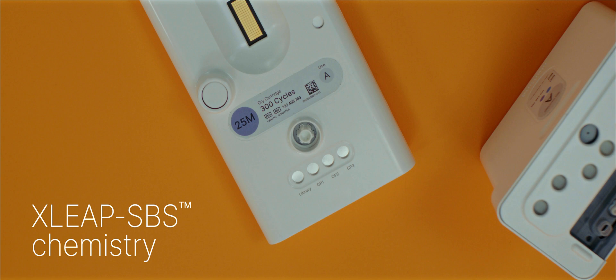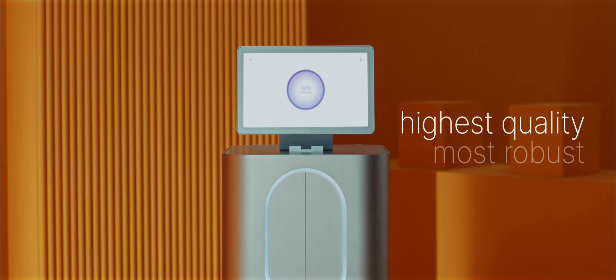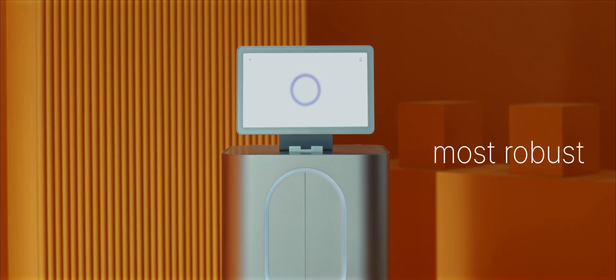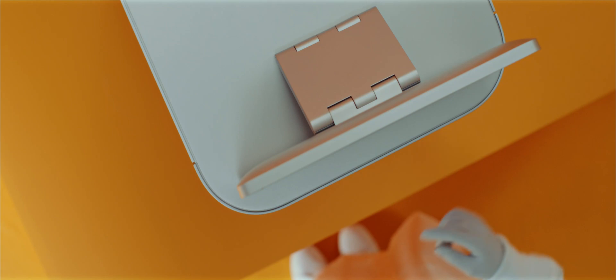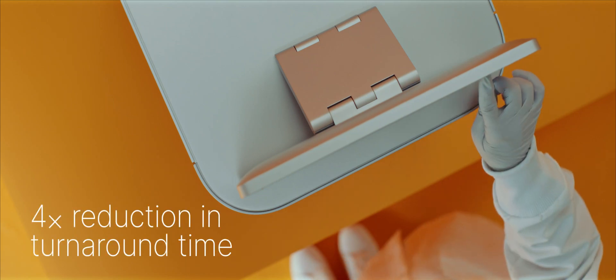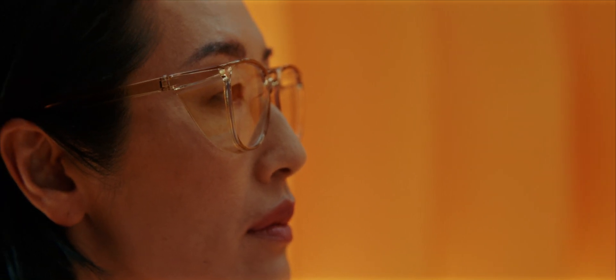XLEAP-SBS chemistry, our fastest, highest quality, and most robust sequencing by synthesis chemistry, enables a four-fold reduction in turnaround time compared to the MiSeq system, providing same-day results.